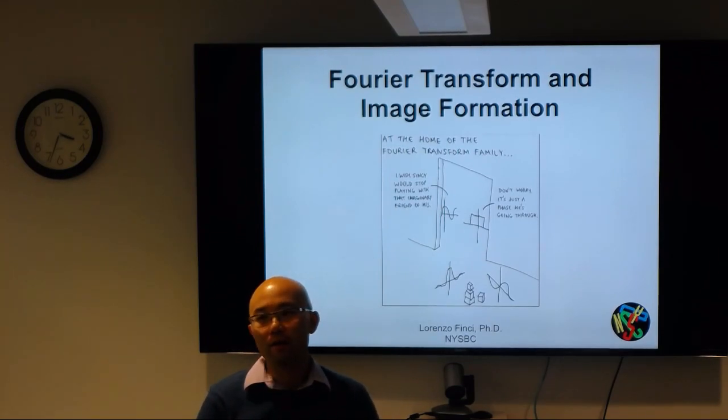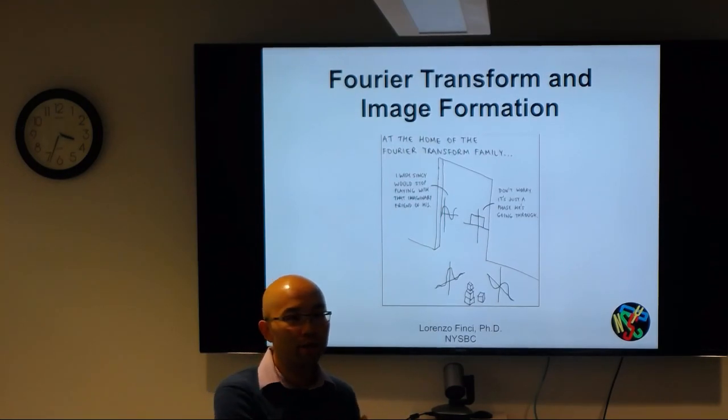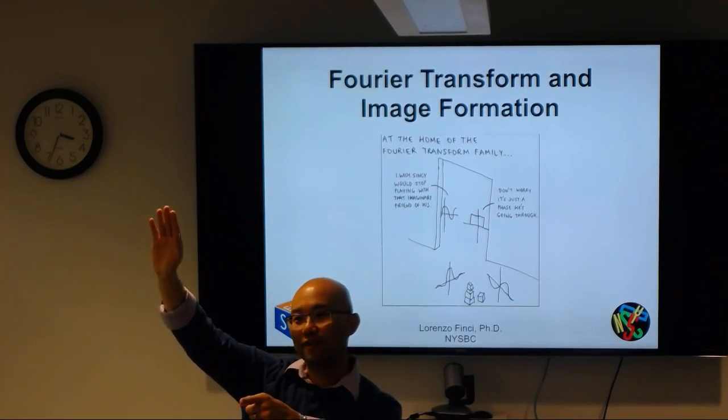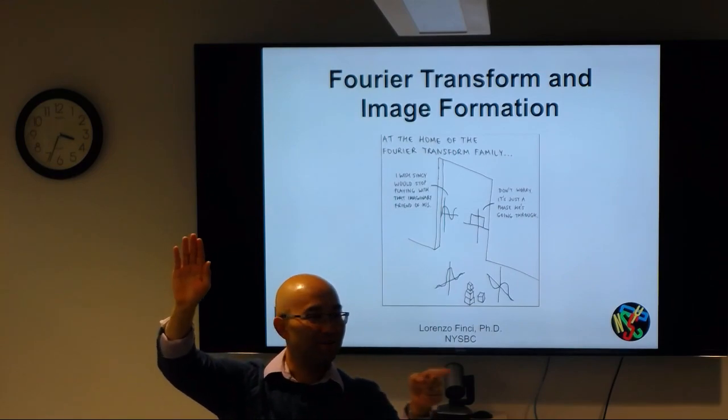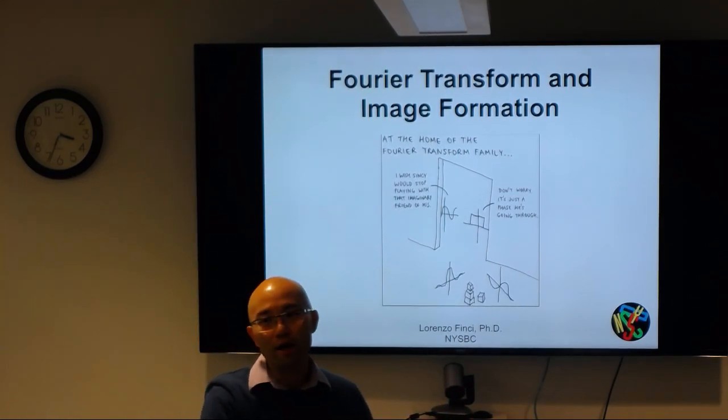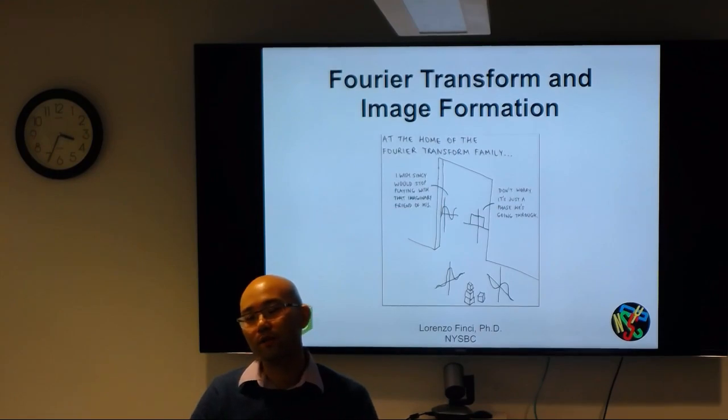Now, some of you are structural biologists. How many are actual structural biologists, X-ray crystallographers? So you understand Fourier transforms? Yeah. You do? You have some sense? Okay, so that's great, because the hope here is we can augment some of that knowledge as well as spin it towards what are the relevant concepts when we go into, let's say, single particle, like projection theorem, things like that.